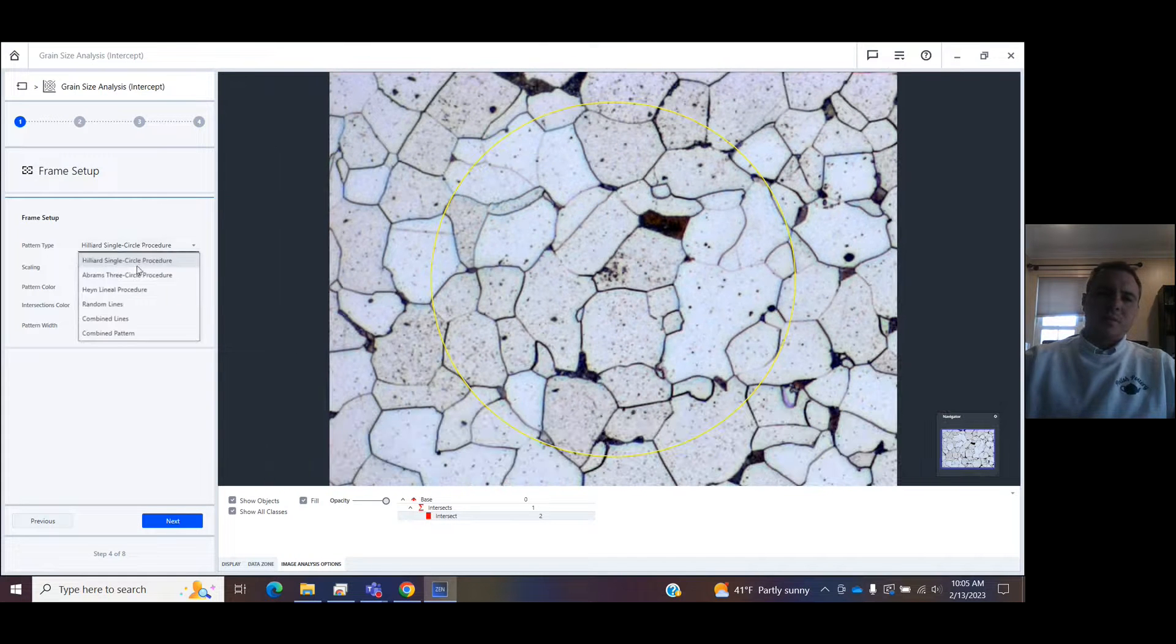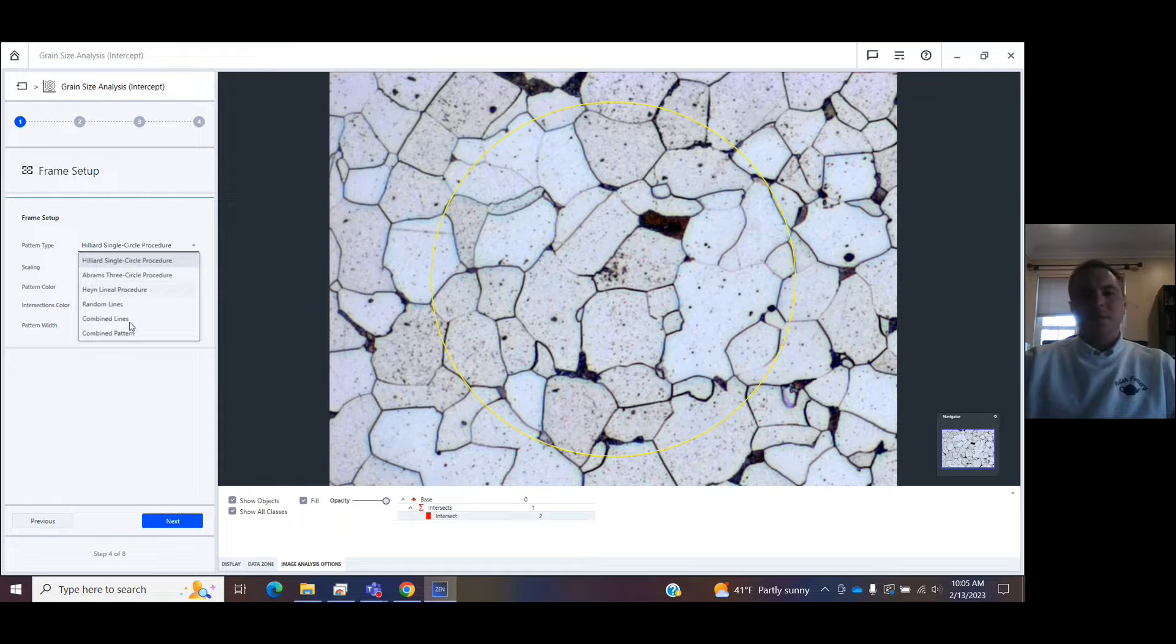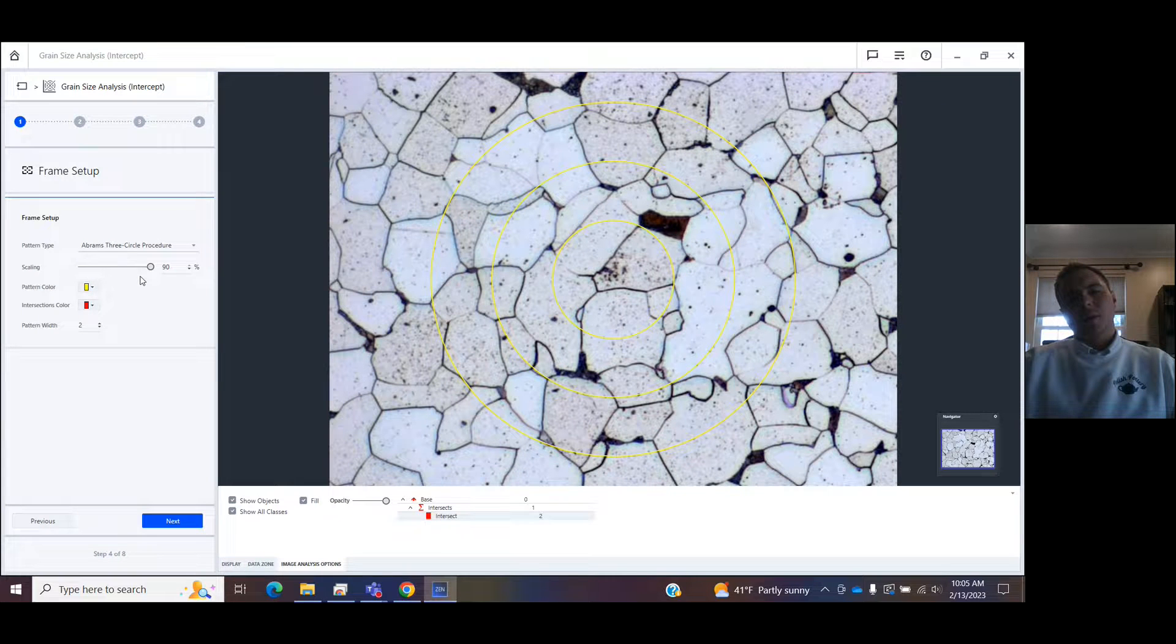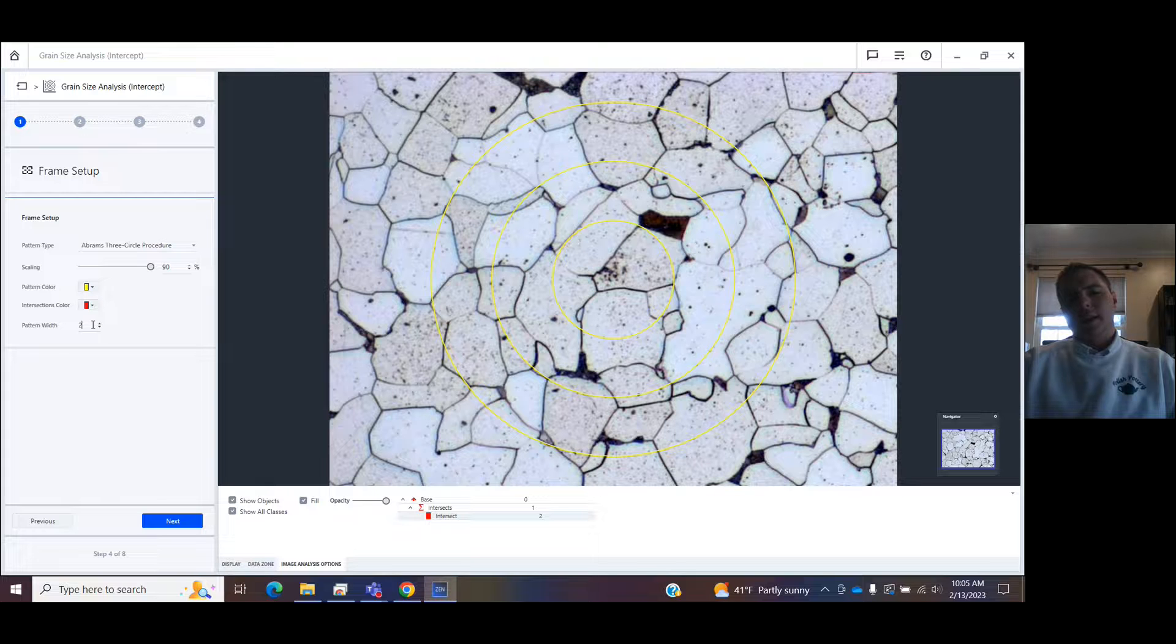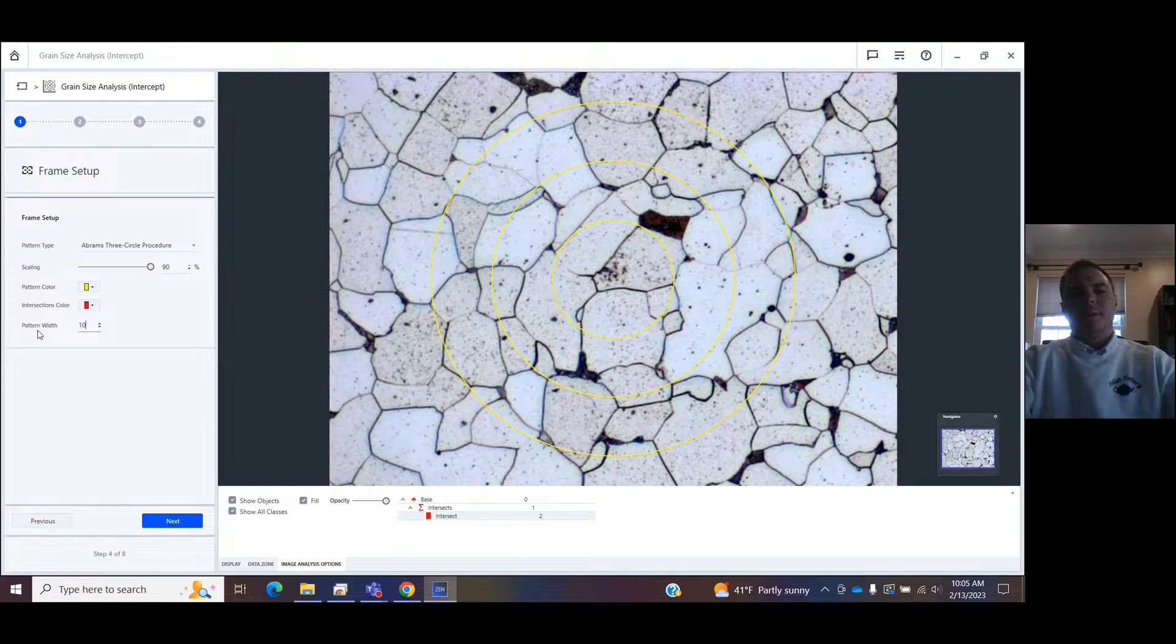Choose which intercept method you want to use. Go with the Abrams 3 circle type. You can edit in here the color and how wide you want it.